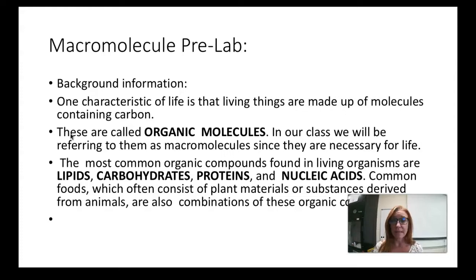Okay, we're going to run some chemistry. I have run some chemical testing on some common foods. And remember, foods are made of living organic compounds, tissues. That's what you're eating when you're eating food. So let's take a look at what kinds of macromolecules are in different structures and in different foods.